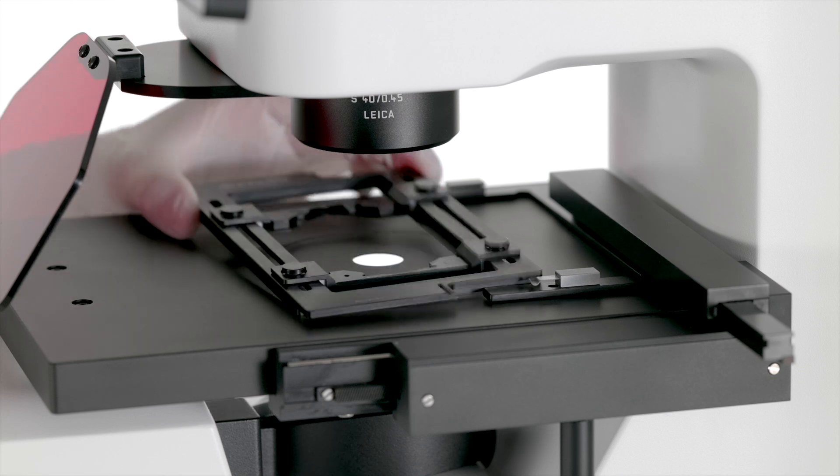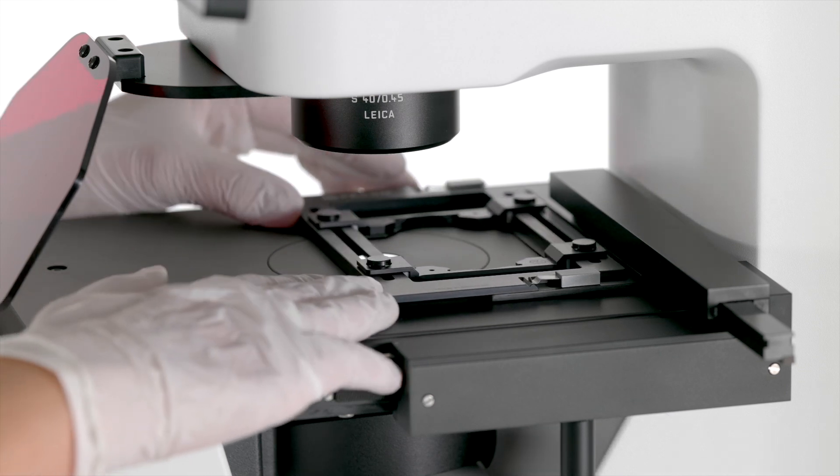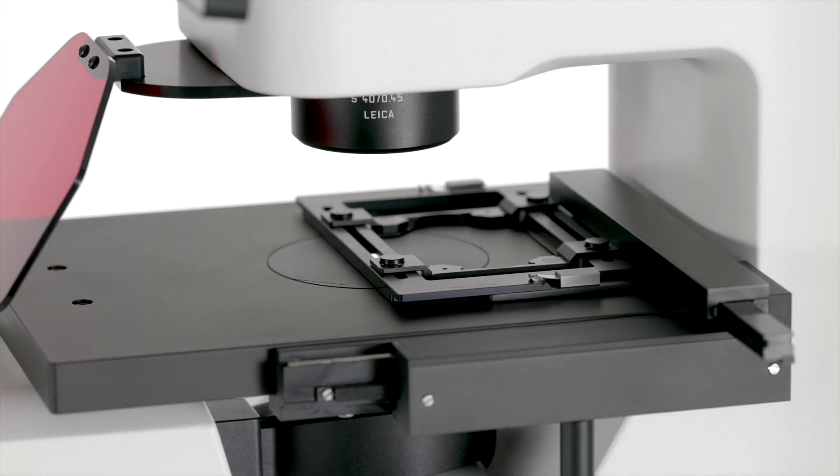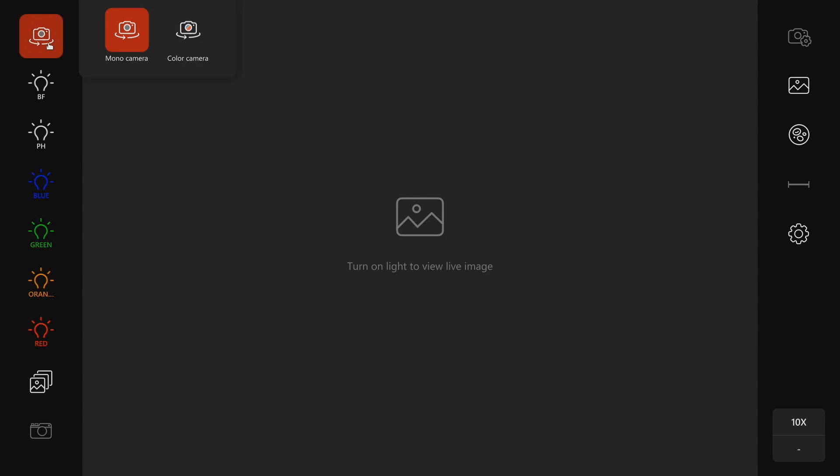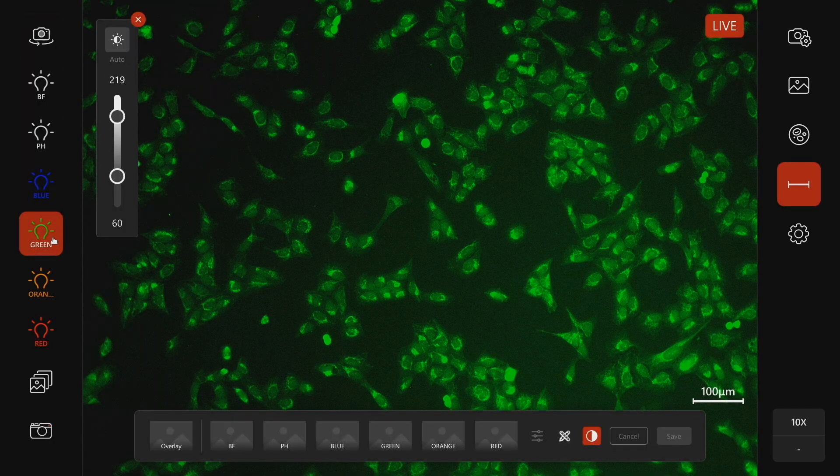To install the holding frame, just clip it into the holder and it's ready to go. Select your desired camera and channel from the main screen and Mateo FL is ready for your first experiment.